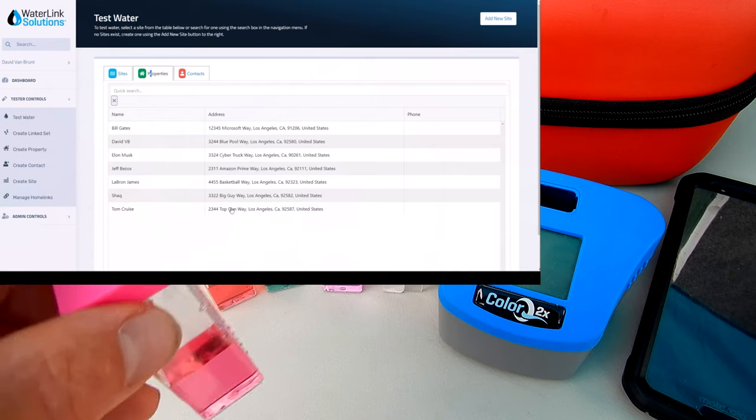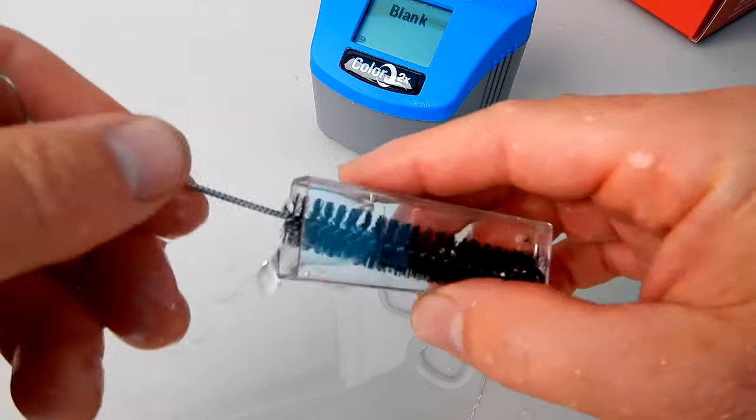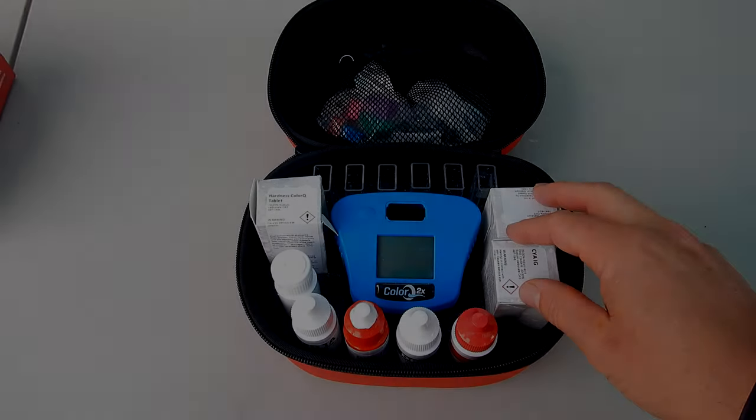After each test you want to take the included brush and clean out the test tubes. Just make sure that they're really cleaned out and there's no reagent left over.